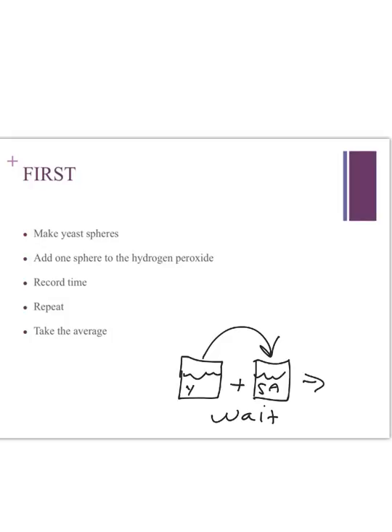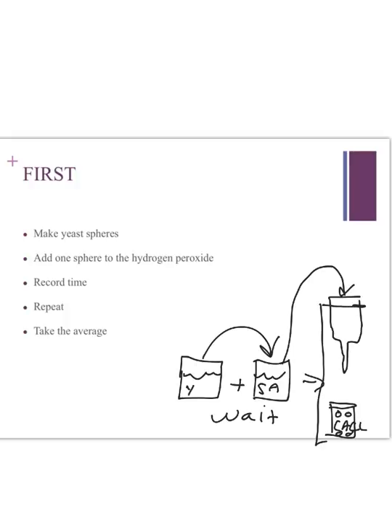And then this mixture is going to be dropped into a beaker of ice cold calcium chloride, and it's going to form these spheres. And this will be sitting on a clamp, just like this. Okay?